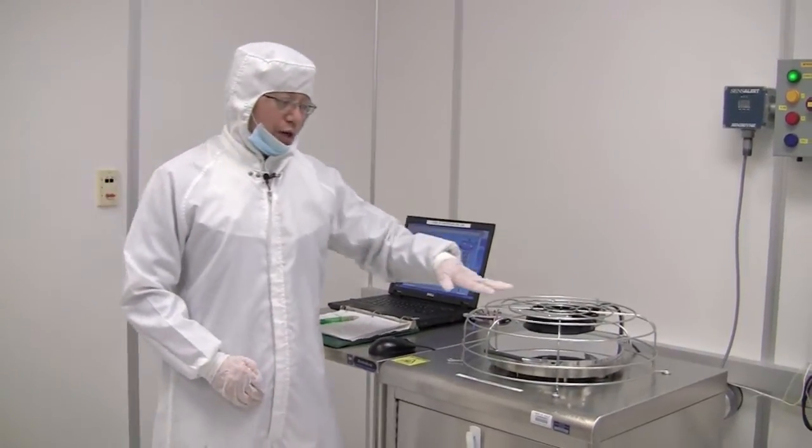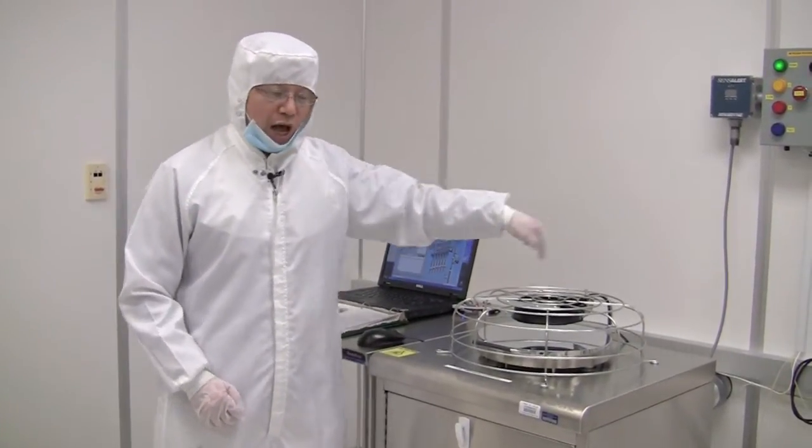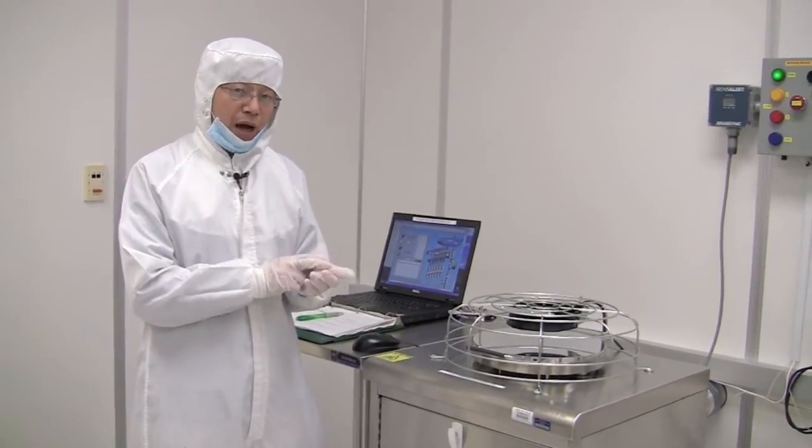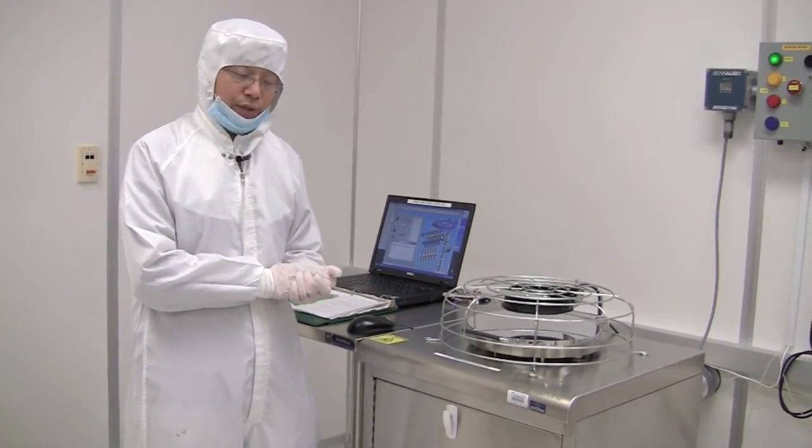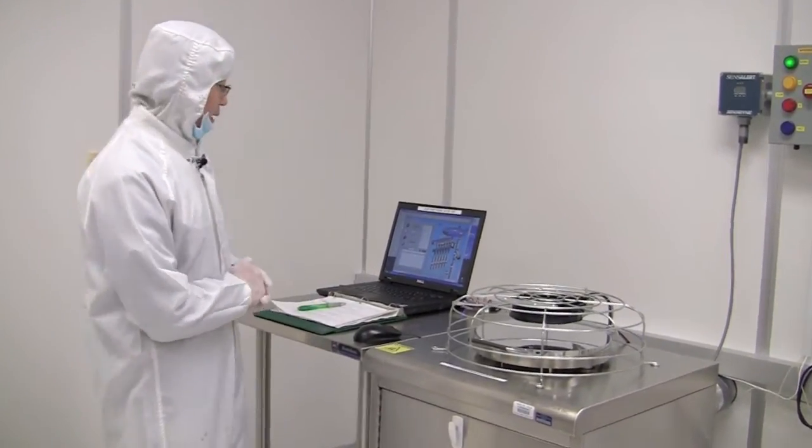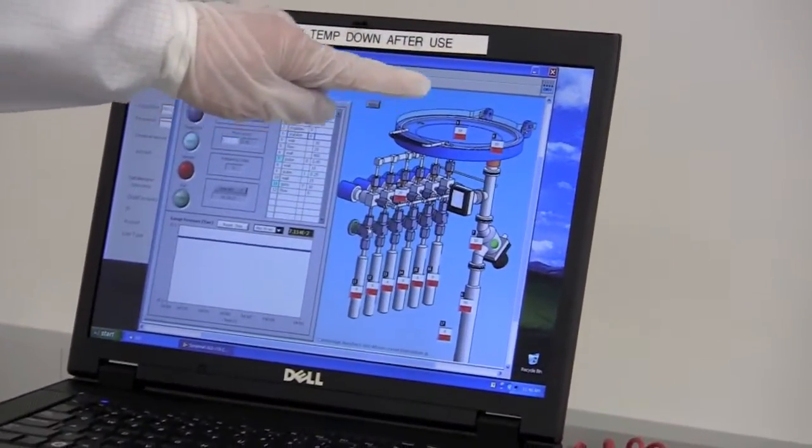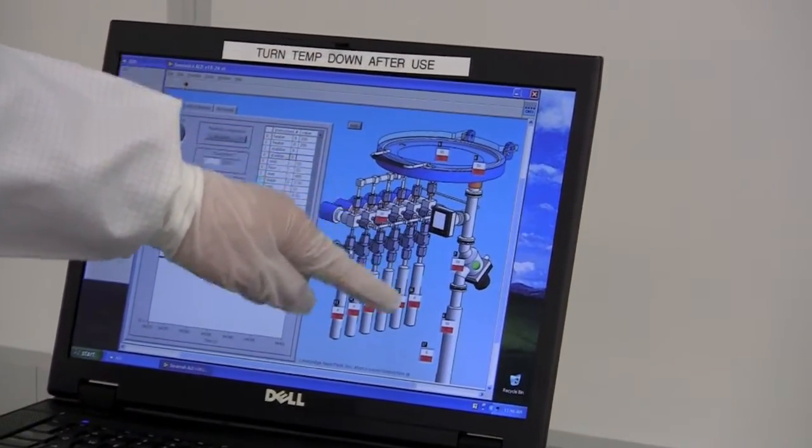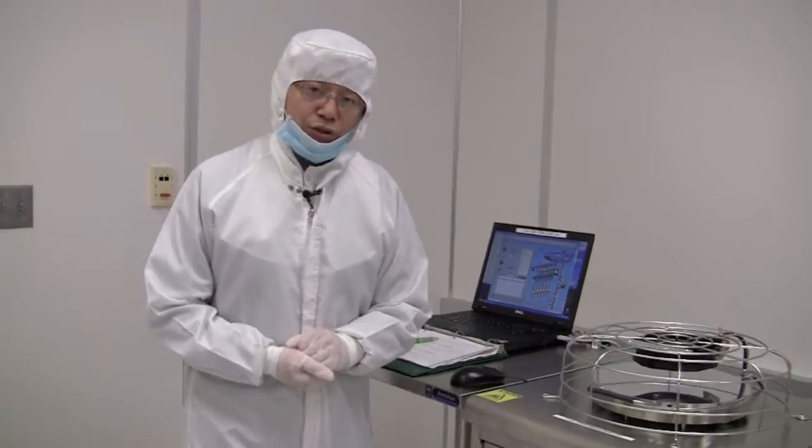First, there should be no flammable material on the shield or anywhere around the tool. Second, there should be no photoresists and polymers on the samples you put into the chamber to avoid the contamination. Third, you should always use the clean metal tweezers. The temperature should not be set over 200 degrees C for the chamber and 150 degrees C for the pipeline.